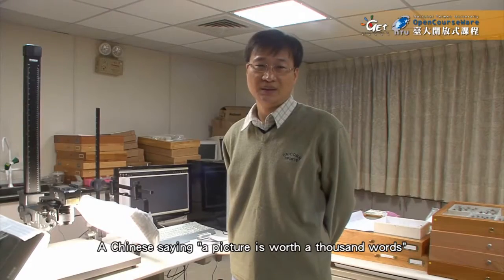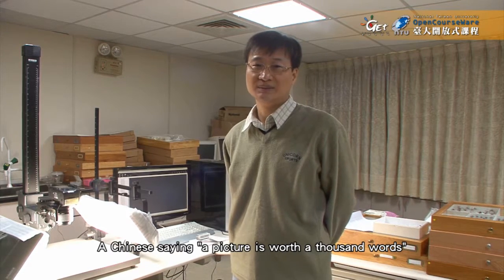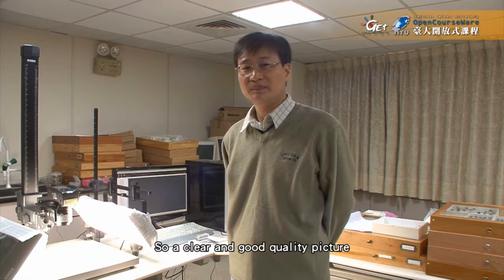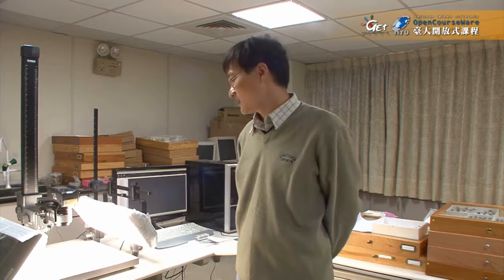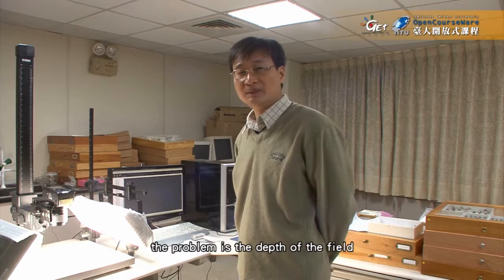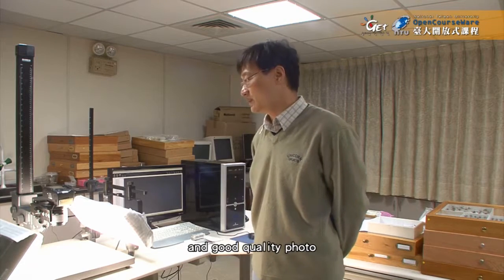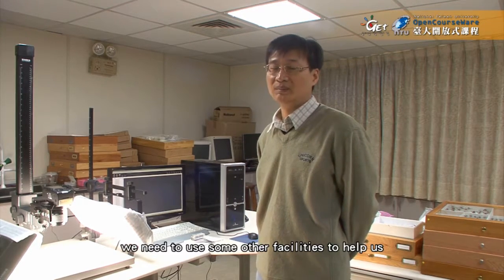A Chinese saying: a picture is worth more than 1,000 words. A clear and good quality picture can give more valuable information. For insects, the problem is the depth of field, so if we need to get a clear and good quality photo, we need to use some other facility to help us.